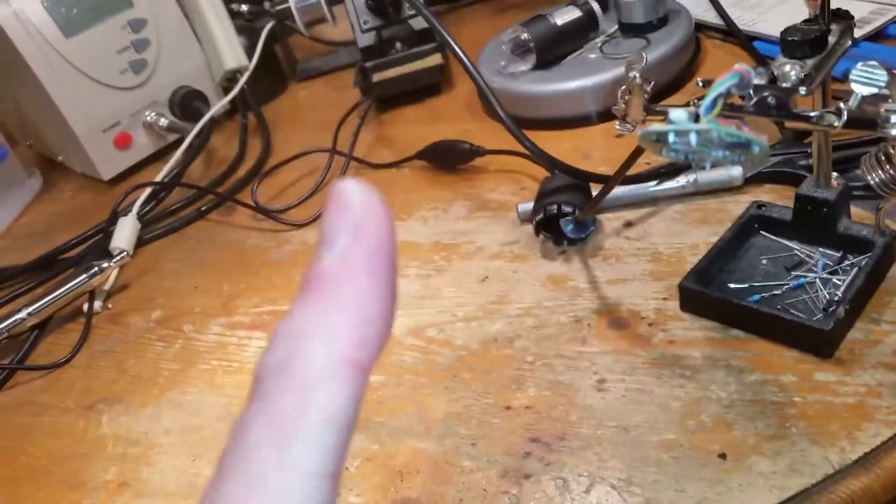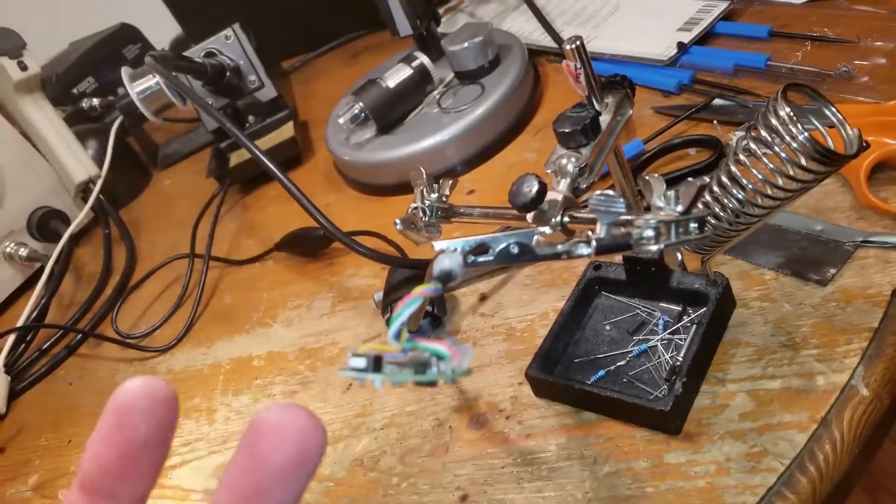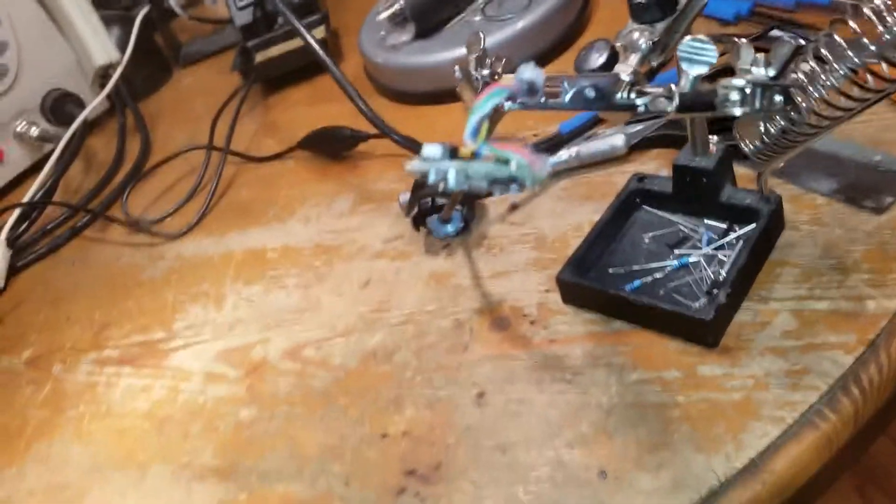USB is basically: red is five volts, black is ground, and in between you've got data plus and data minus. So I thought one of the wires has come off inside. Getting into it was an absolute nightmare.